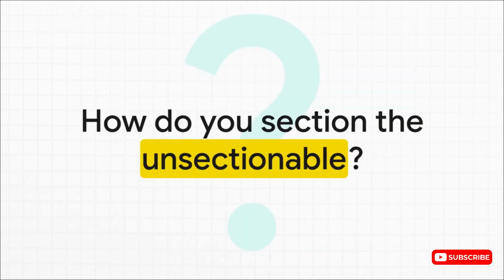Picture this. You're a histotech, and you get a sample, maybe a bone biopsy. It's hard, it's dense, it's packed with calcium. How in the world are you supposed to get a slice of that thin enough to see through on a microscope slide? That's the core problem we're going to solve today. How do you section the unsectionable?